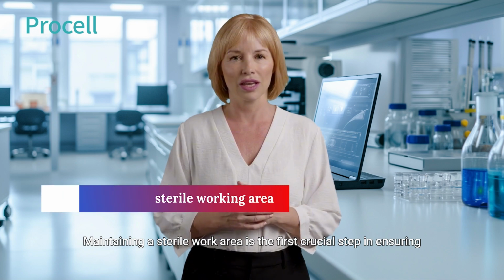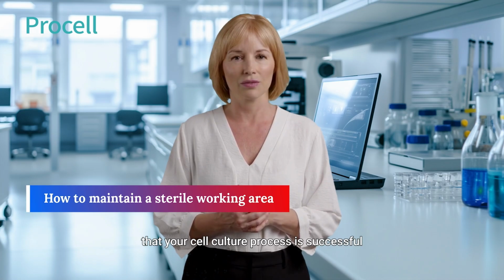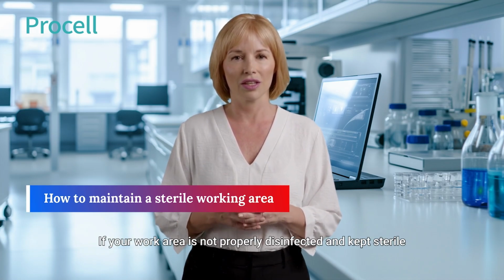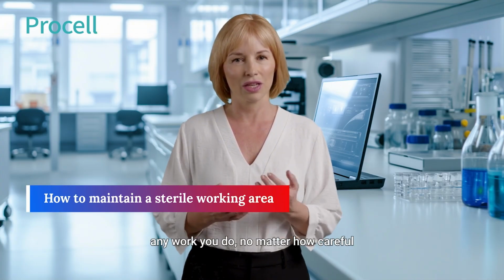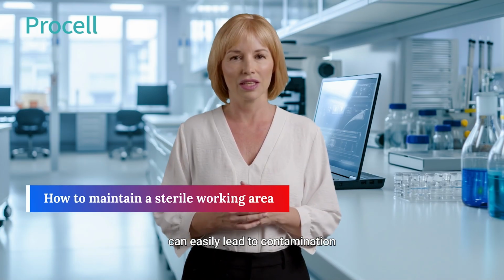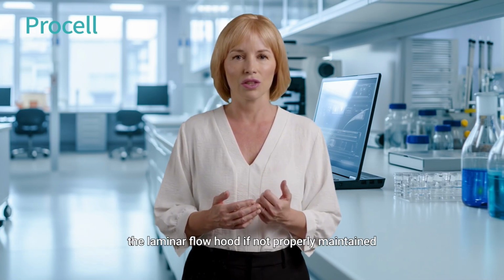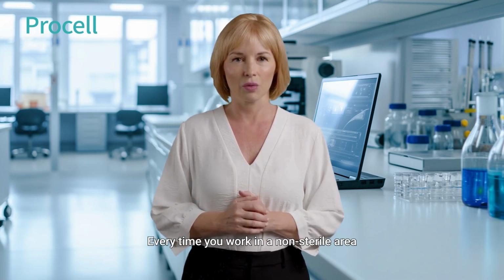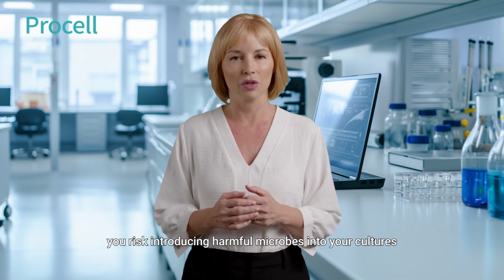Maintaining a sterile work area is the first crucial step in ensuring that your cell culture process is successful. Think of your workspace as the foundation of your experiment. If your work area is not properly disinfected and kept sterile, any work you do, no matter how careful, can easily lead to contamination. The key here is that contamination can come from any surface you're working on. It might be the bench, the laminar flow hood if not properly maintained, or even the equipment you use. Every time you work in a non-sterile area, you risk introducing harmful microbes into your cultures.